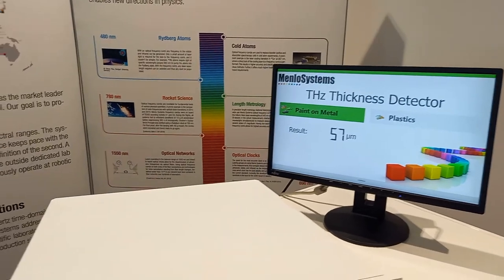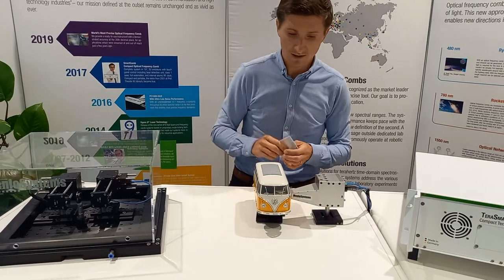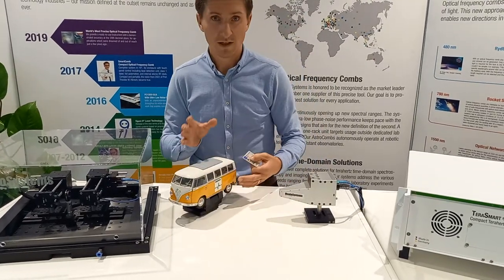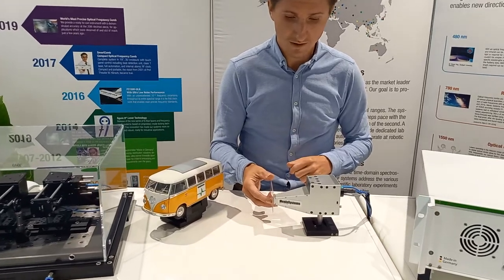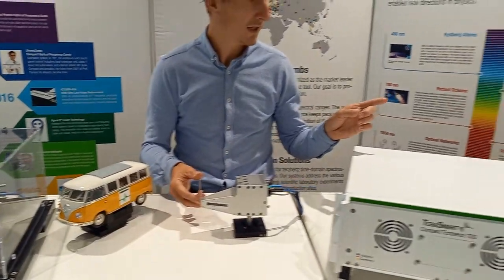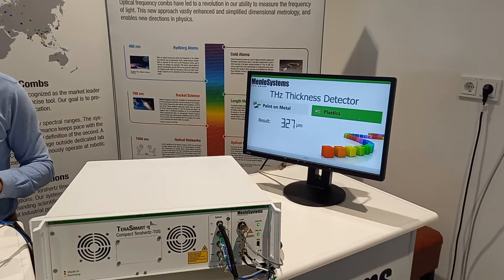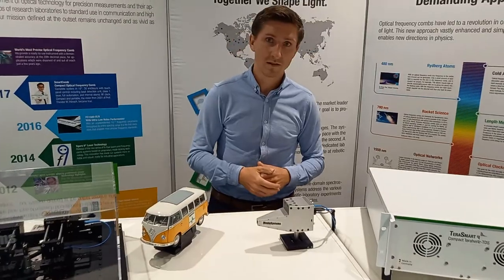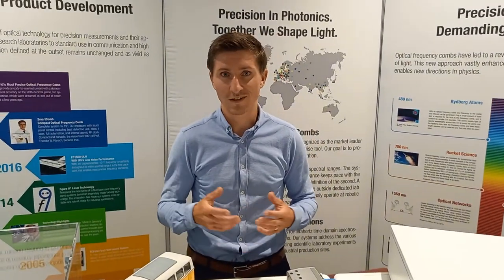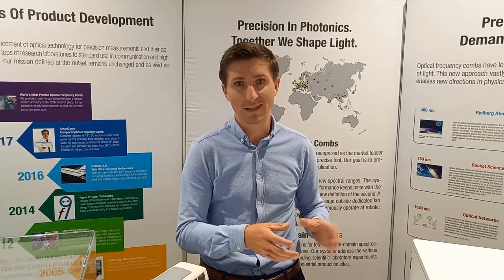We can do the same using my driver's license, which I have prepared here. I replace the wagon sample with my driver's license, put it very close to the front, and if you follow the monitor, we see 900 micrometers of thickness for such a driver's license. This is a pretty straightforward and precise mode of non-destructive testing, and it's only one method of using a Terahertz time-domain spectrometer.